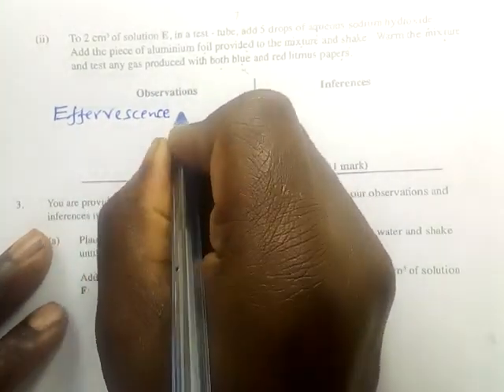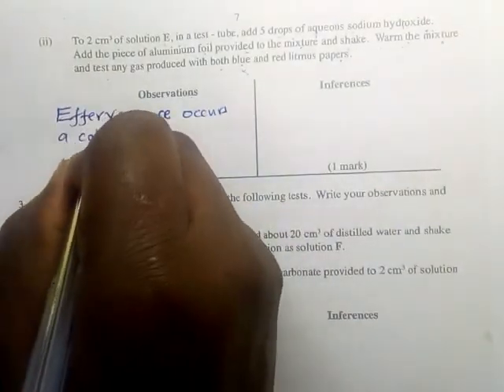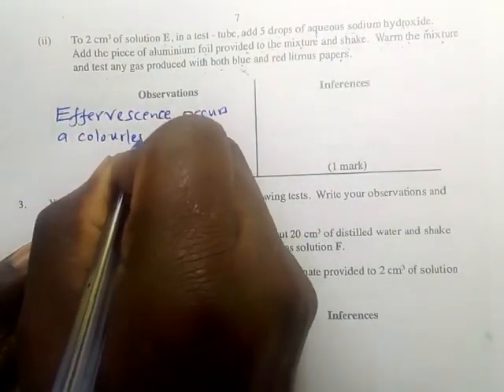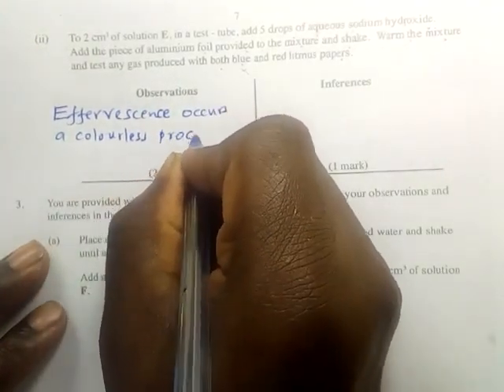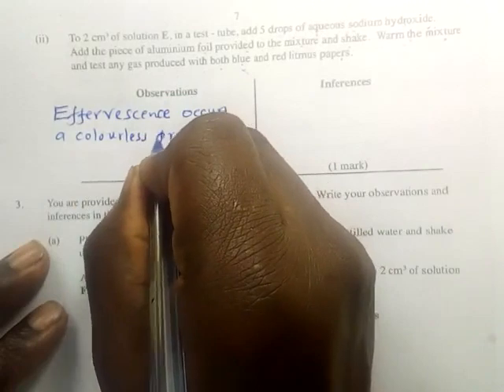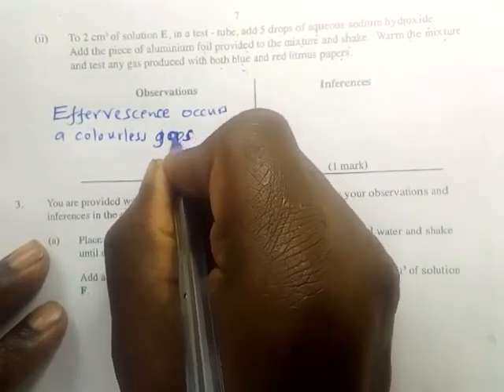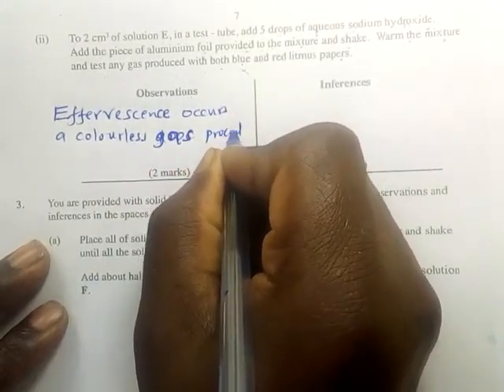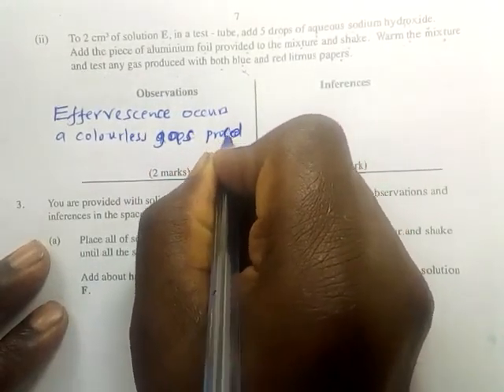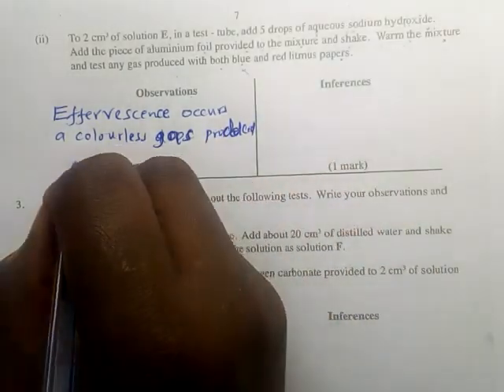Effervescence occurs, a colorless gas is produced.